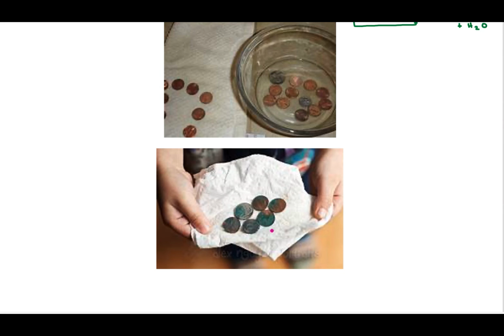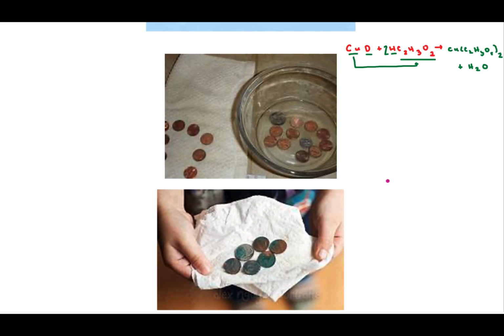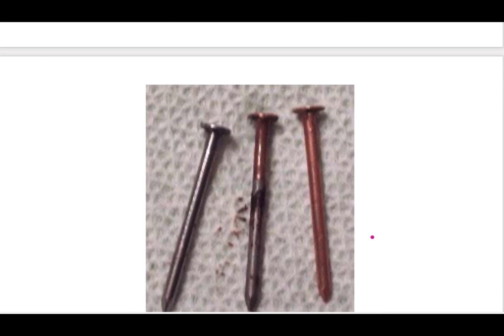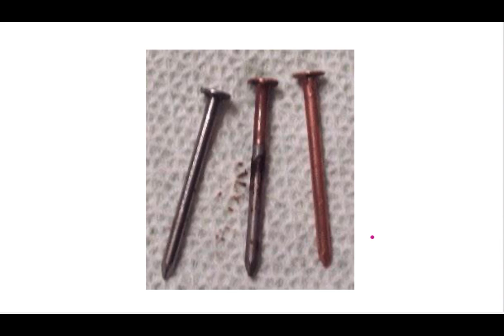Okay, so these are the pennies that you did not rinse, that you allowed to stay out, allowed to react with oxygen. So you had the copper ions, you had the chloride ions, and now you had the oxygen, and it forms this compound called malachite. All right, let's talk about the very last thing that you did. You had your solution, which had copper ions and chloride ions in it because you added salt, and then you added a nail. All right, so that was the last part.